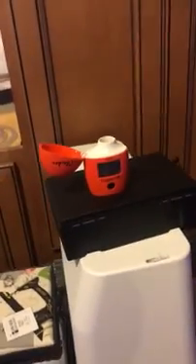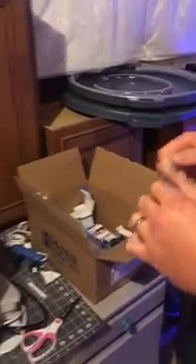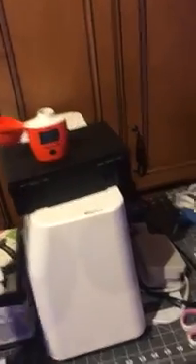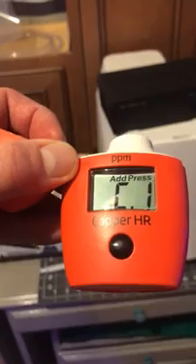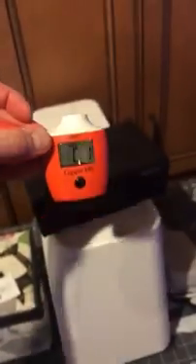The way that the tester works is it actually takes two readings. So you take your empty cuvette, you fill it up, you put it into the tester, it takes a zero sample, then you add the reagent or powder, and it actually takes the reading, which takes 45 seconds to do. Hopefully that copper is mixed well enough now.